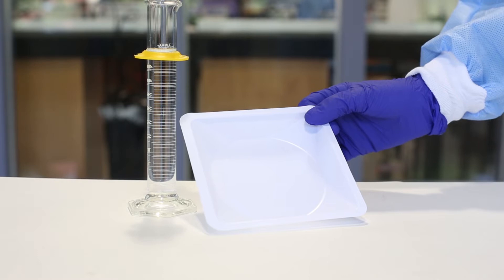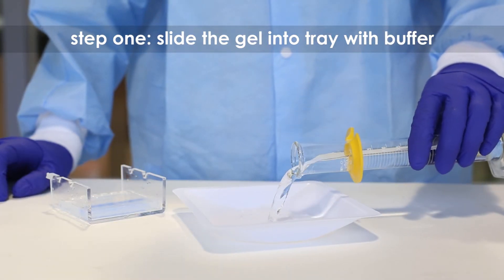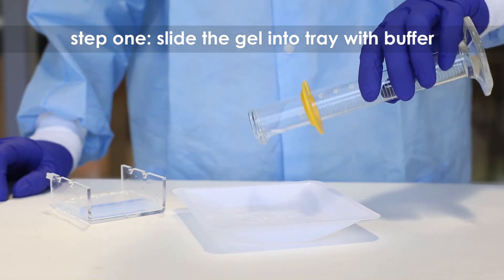Step 1: After electrophoresis, slide the agarose gel into a tray containing at least 75 ml of distilled water or electrophoresis buffer.